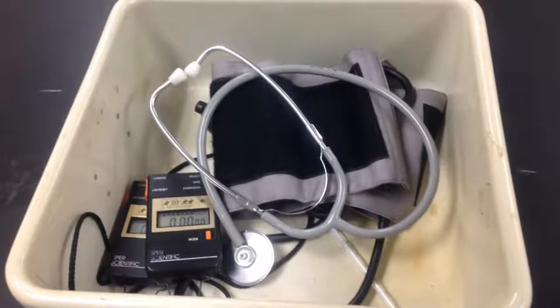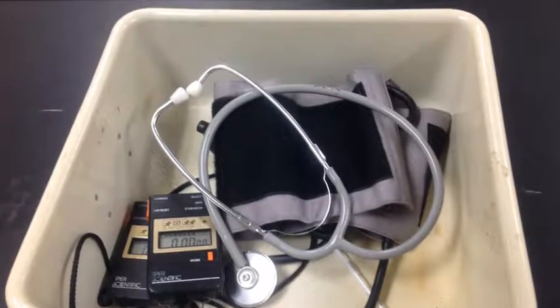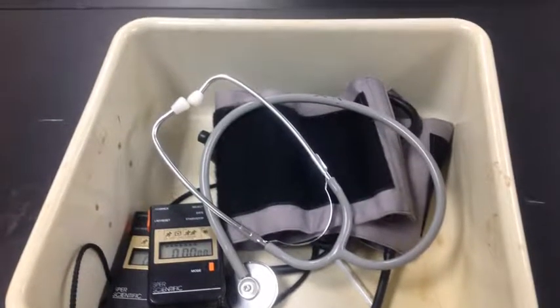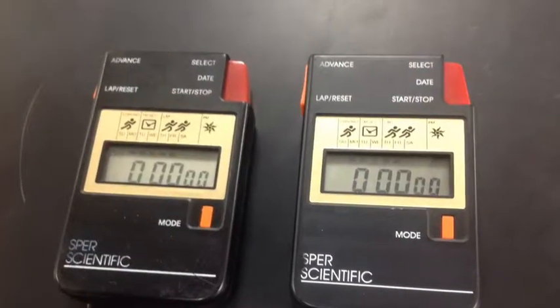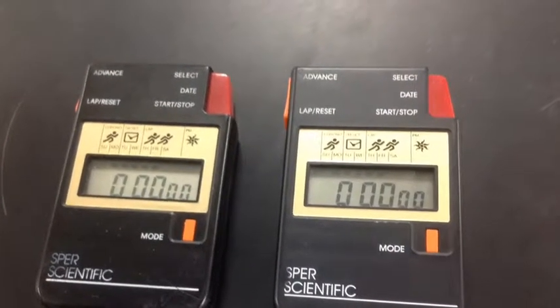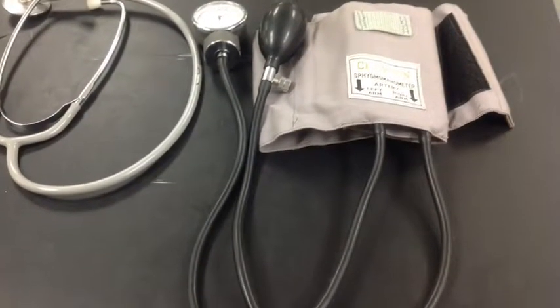For this lab, you are going to be working with one other group of two, making a group of four. Each group of four will need one bin. Each bin will contain two stopwatches, a thermometer that measures in degrees Celsius, a stethoscope, and a blood pressure cuff.